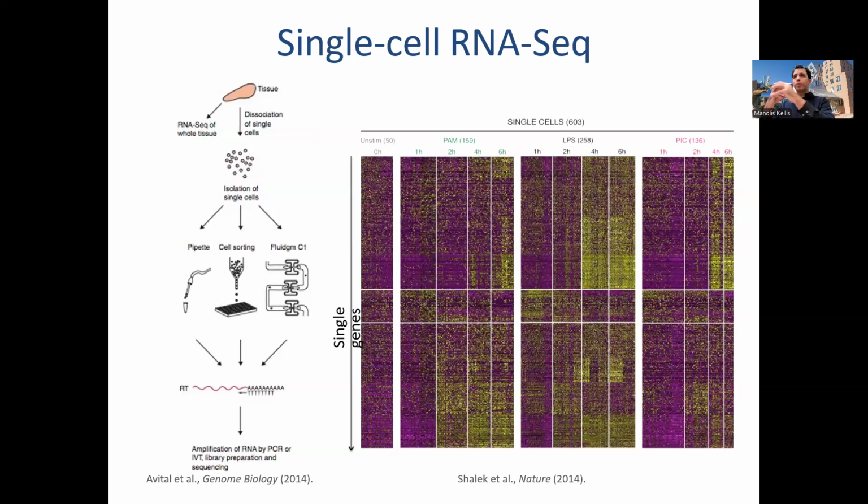And of course, when we're isolating individual cells, or individual nuclei, there might be stuff stuck on them. As we lyse the nucleus, or as we lyse the cell, there might be some ambient contamination. And that contamination might be greater depending on the health of the original cell. If you're taking cells from a cancer patient, they might be more prone to this type of contamination. If you're taking cells from a very elderly individual, or from someone with neurodegeneration as the neurons are dying, the state of their nuclei, the state of their cells might be compromised, not just when you're carrying out your experiment, but even before. Maybe there are more types of contamination because that individual is sick or elderly and so on and so forth.